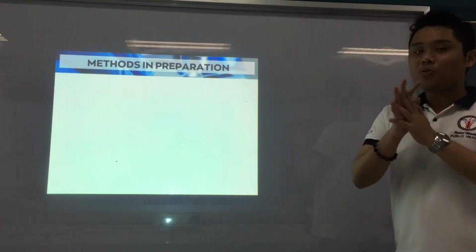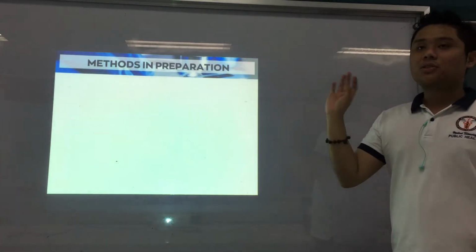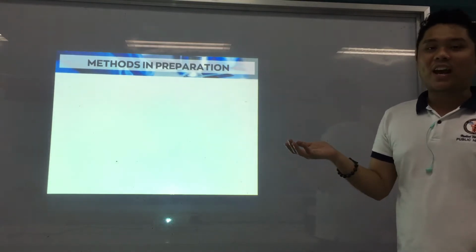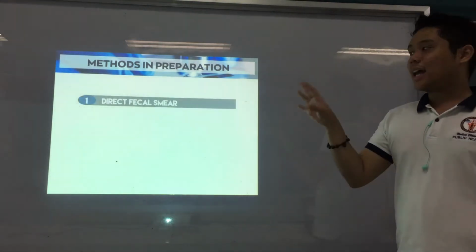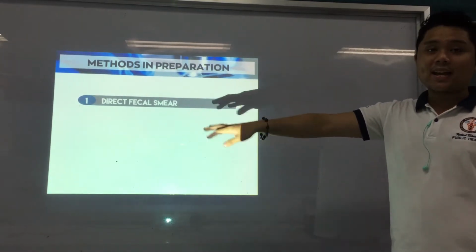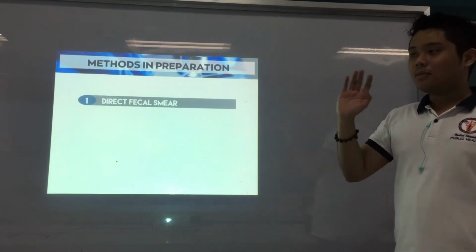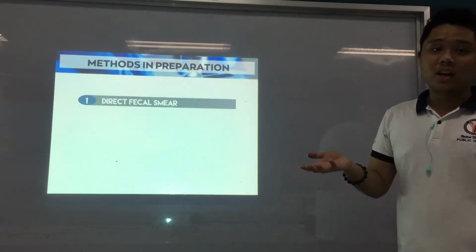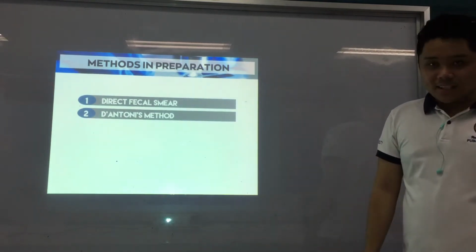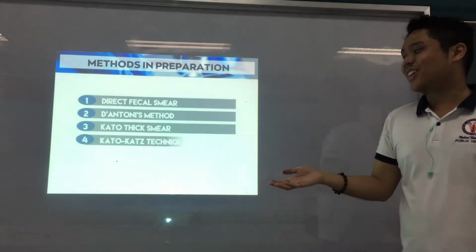But anyway, for this second video on our lecture on the preparation of fecal smears, we'll go now to the different methods in preparation. We'll start first with the most popular and most common method in the parasitology laboratory, especially when you work as medtechs, which is to create the direct fecal smear for stool specimens. Then we go to the D'Antoni's method, and then the Kato-Thick, and the Kato-Katz.